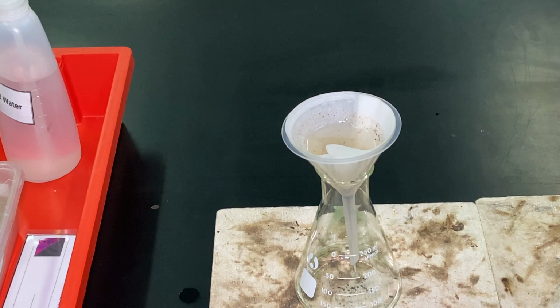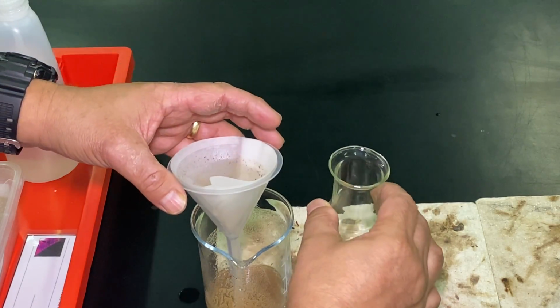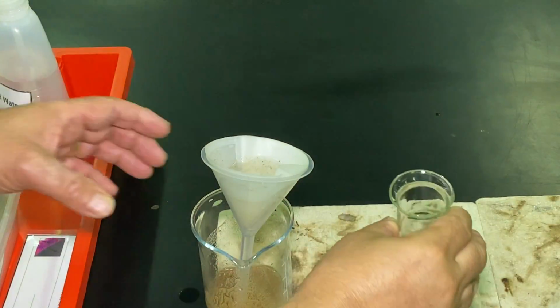Now, let's get the evaporation process on the go. So let's just light the Bunsen burner, obviously put it onto a blue flame. Let's get that heating. Right, so I can get this process started. I'll just transfer that just for the time being. So the pure solution of sodium chloride can go into there.